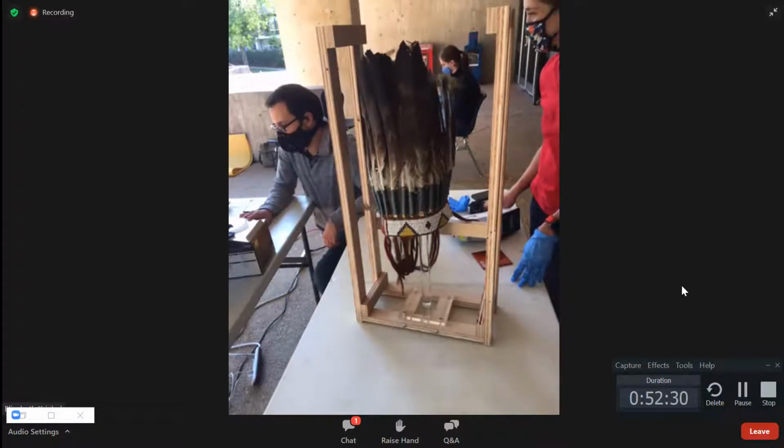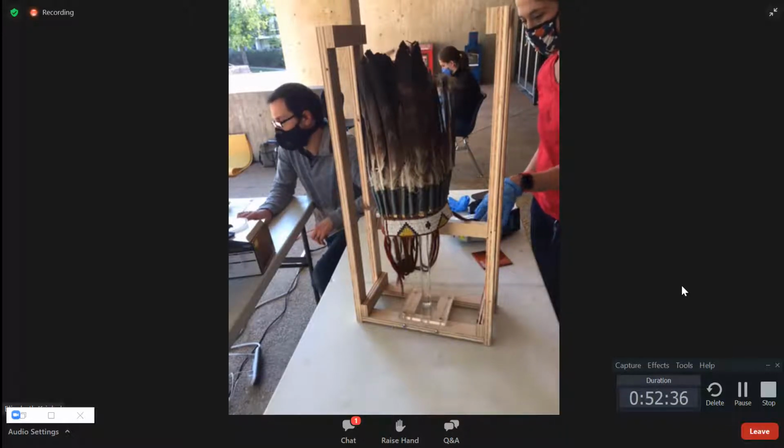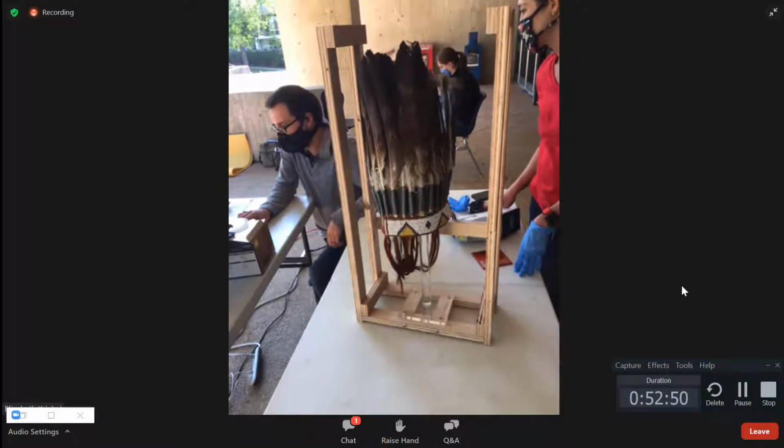All right, so no mercury on this one. So these guys are totally in the clear. Can we guess what's making that red color with the dye? Yes, it's iron. It's hematite. Lots of iron. Lots of sulfur once again. No evidence of a ton of chlorine. So these might not have anything on them.